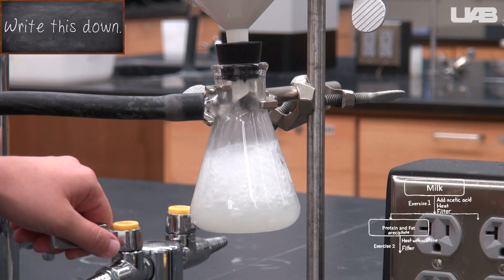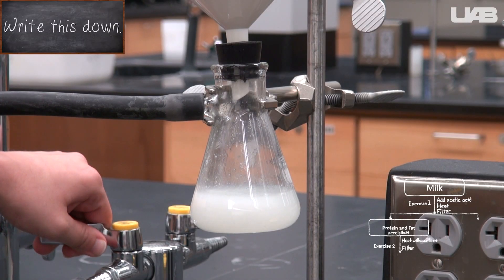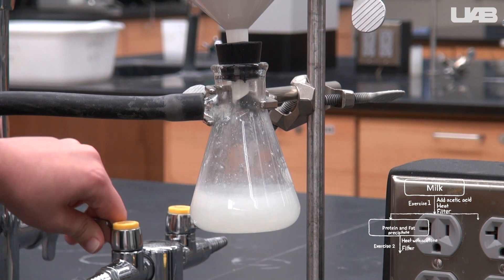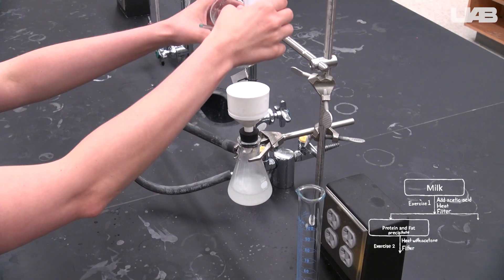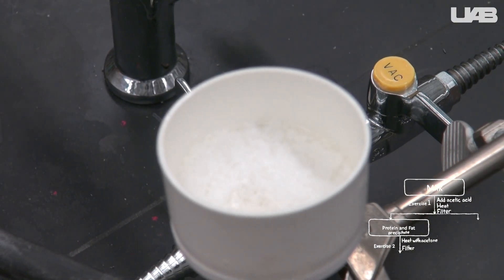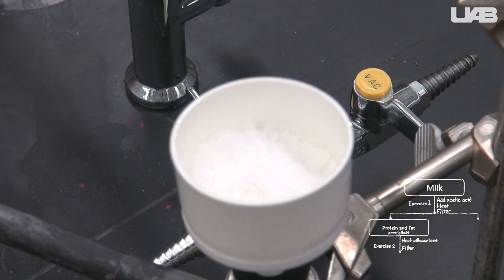Make sure that you do not allow the filtrate to boil. It can boil even though it's not hot. The solvent gases can damage the house vacuum if you let them go through the tubing. After you've completed your washes, allow air to keep passing through until the protein is dry and can be easily removed. Turn the vacuum off.